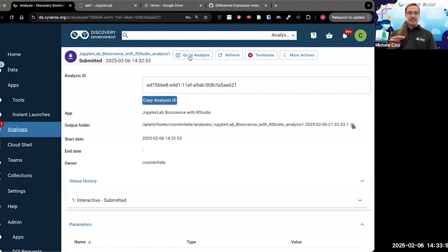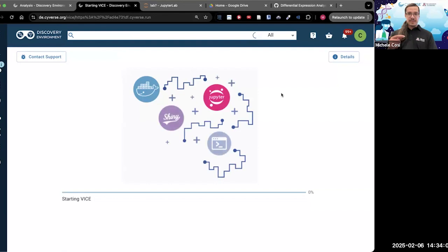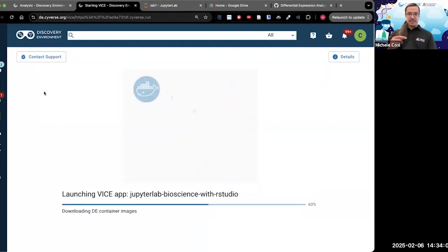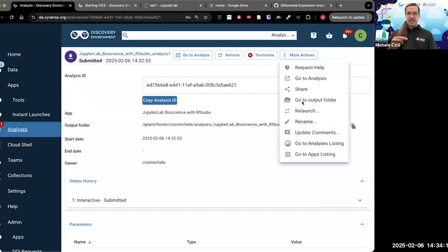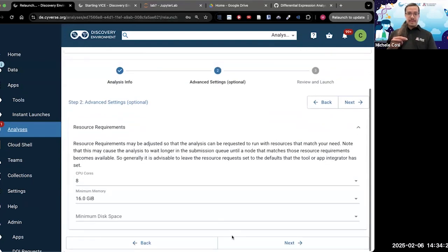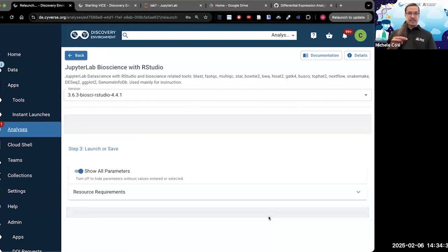I think it's still submitted. I'm going to click Go to Analysis. I want to see if this is starting. It's downloading my containers. Okay. I wonder if it's stuck somewhere. I'm going to click More Actions and relaunch. 8 and 16. Launch analysis.